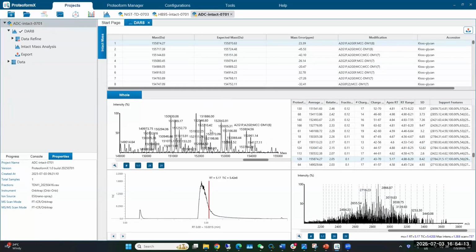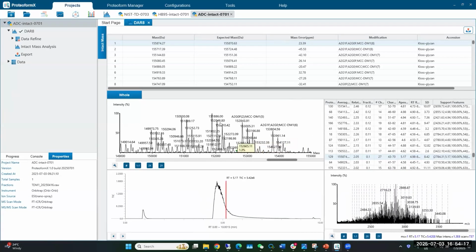It's ADC. Now you can see this is ADC, and we define it. We automatically do assignment when you select those. And this is similar to those ones. Now people are focusing on the study of finding site-specific conjugation. If that's the case, for the most abundant ones, we would like to see only 1 or 2 major forms. Now, in this case, it's not the case.